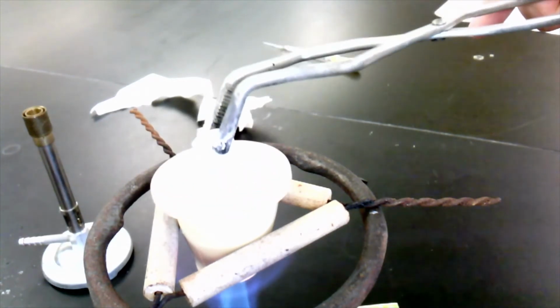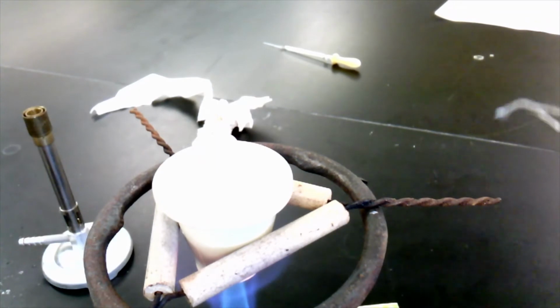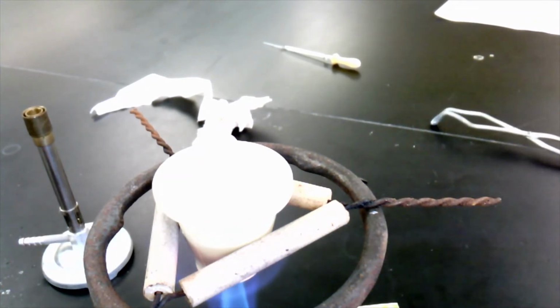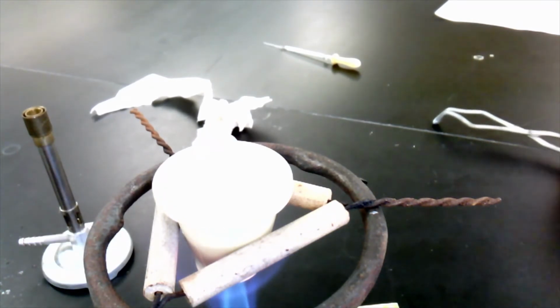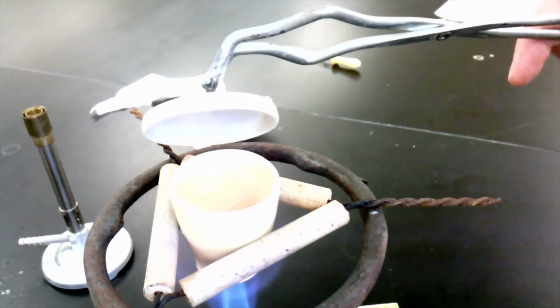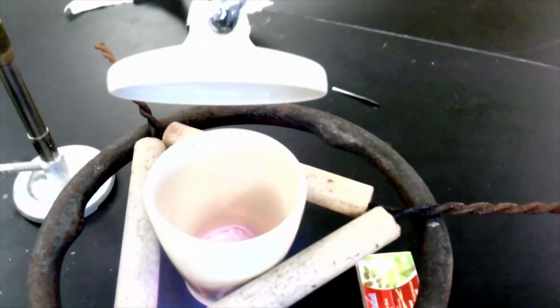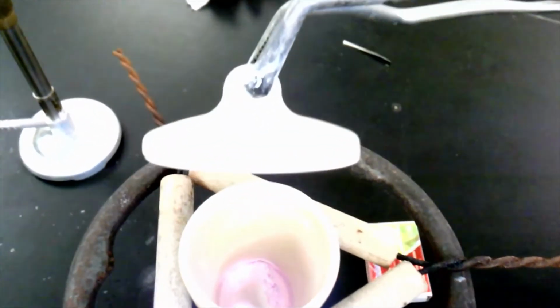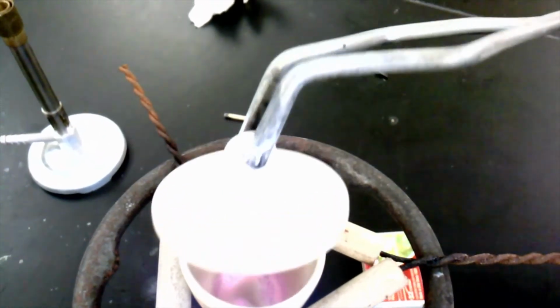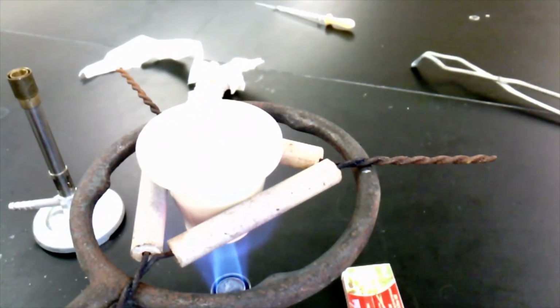I'm going to occasionally lift the lid off to let a little more air in and put it right back. And we're just going to let it do its thing for a little bit. Here, I'll show you one more time. Just going to take the lid off, let it breathe for a second, put it right back on. You can kind of see how it glows real brightly when I take the lid off, because it's mixing with air and actually has something to react with. Magnesium has to have the air to react with.